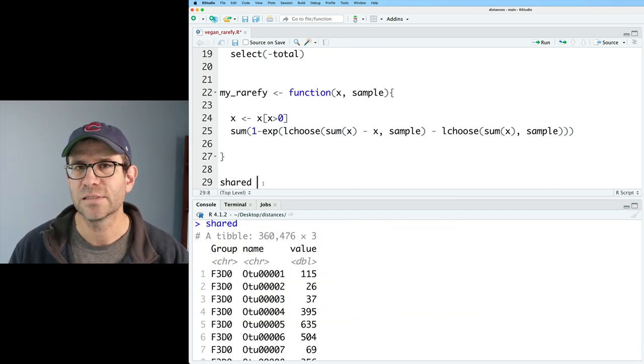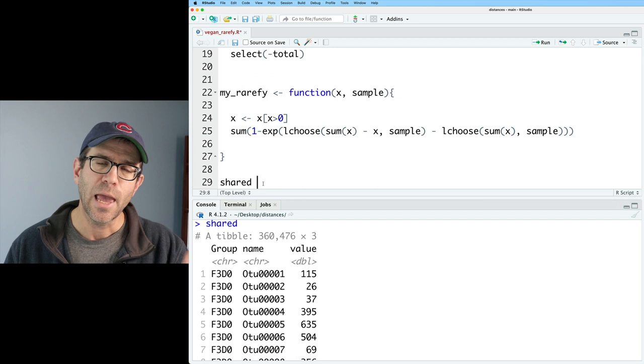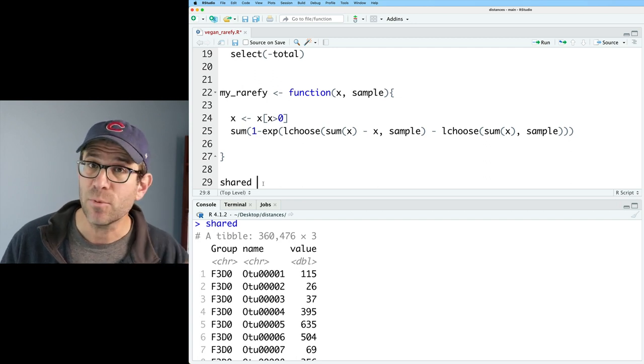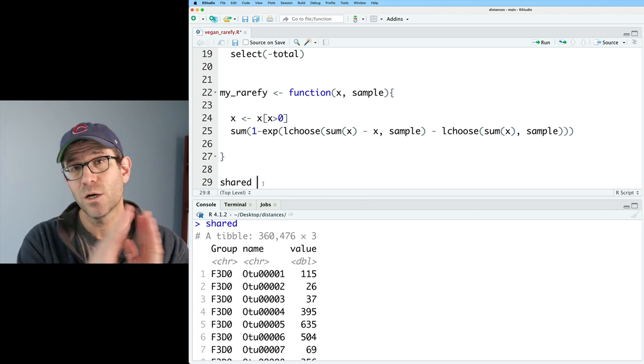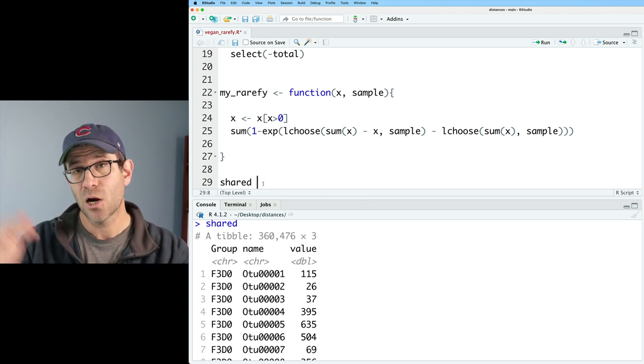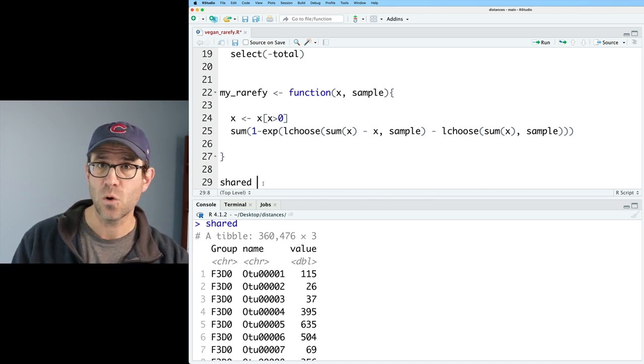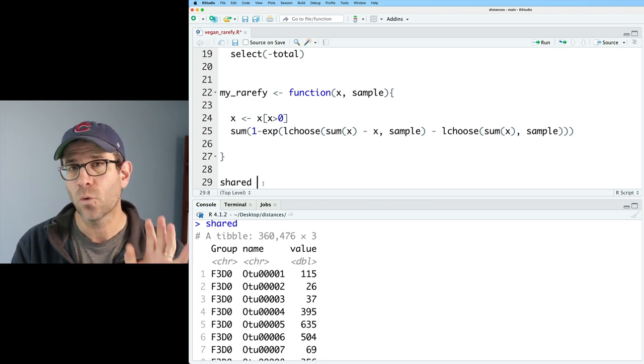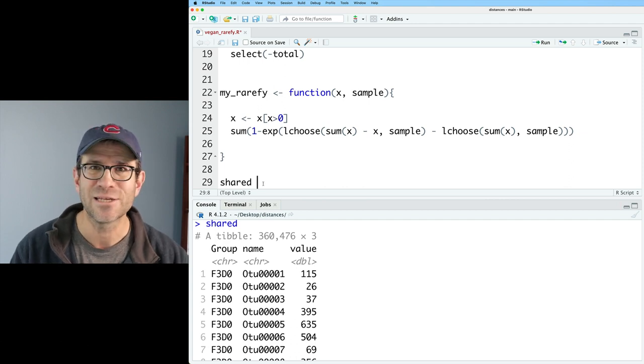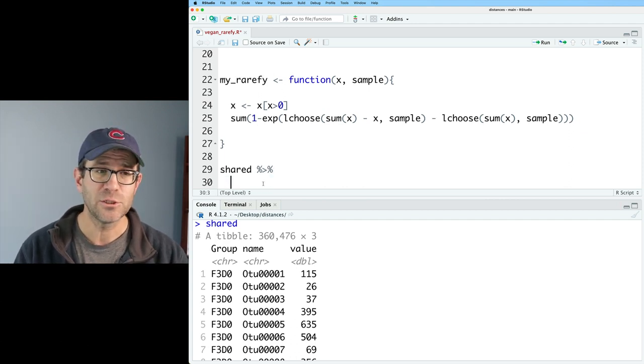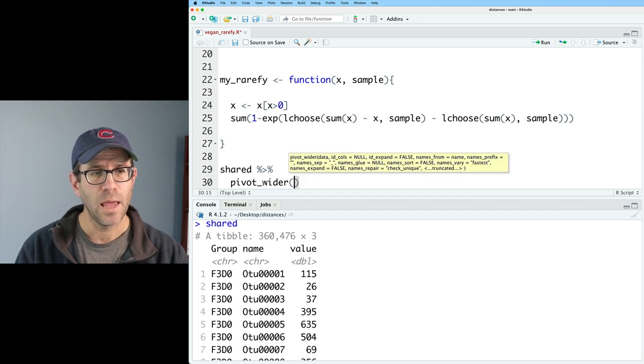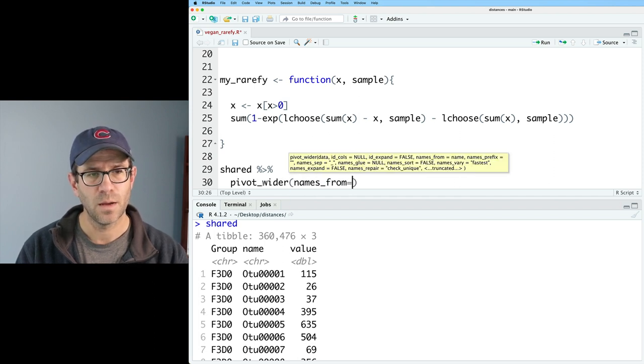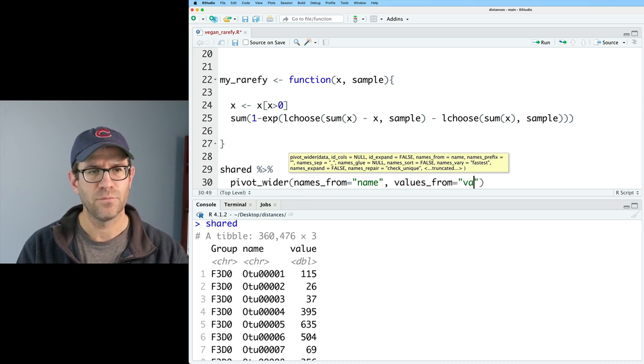Again, we have this as a tibble where we have three columns and to have data that's properly formatted to go into vegan, we actually need this to be a data frame where taxa are across the columns, our samples are in the rows, and that our sample names are the row names. So we need to do a little bit of work to get this tidy data frame into a good working shape for going into vegan. So I'll take my shared data and pipe that into pivot_wider.